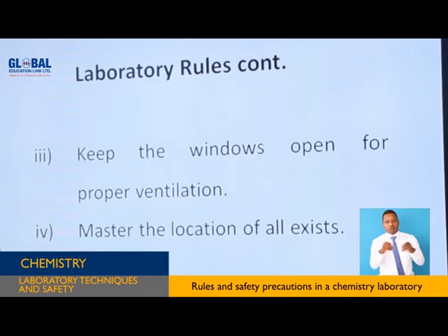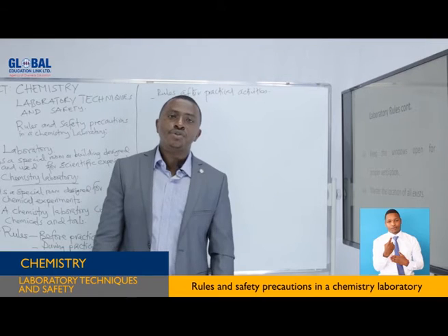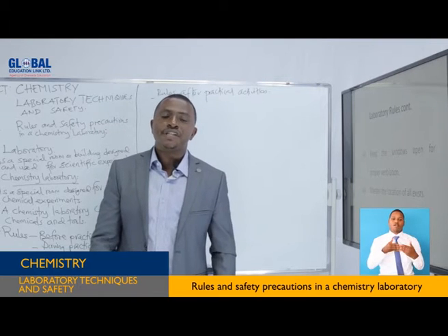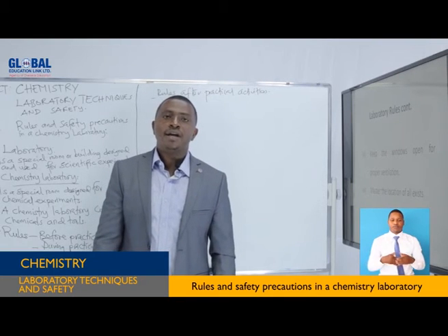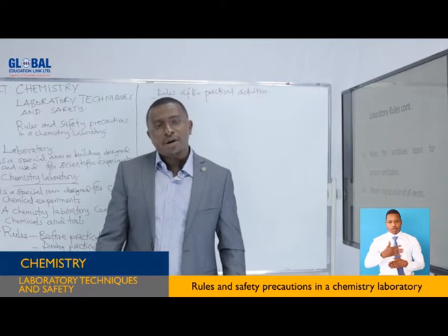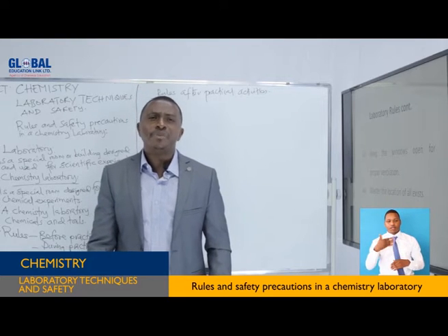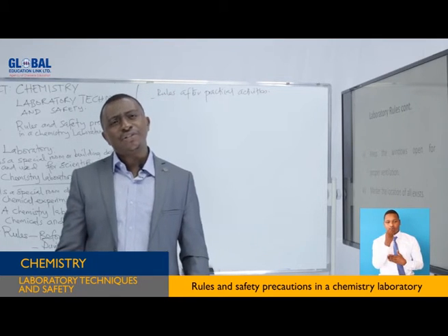There is an advantage of having proper ventilation. Proper ventilation keeps you safe and makes the environment for breathing okay. Also, proper ventilation prevents you from contamination with harmful gases.